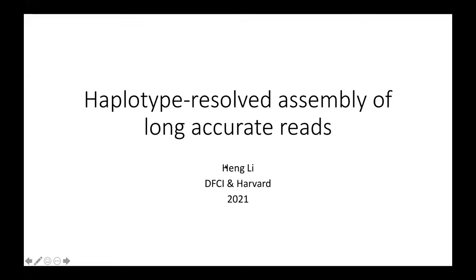Okay, today I'm going to talk about the haplotype resolved assembly of long accurate reads, mostly the HiFi reads.